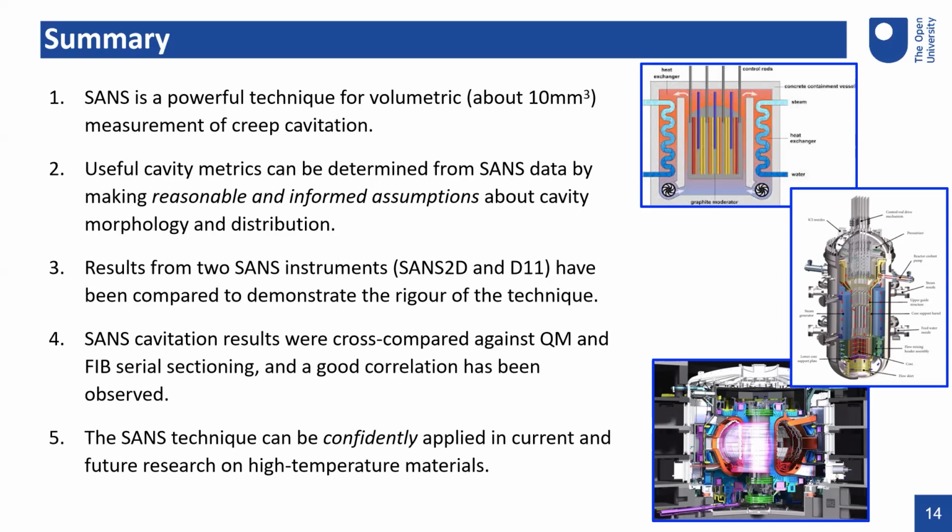So, as a final remark, I think we could confidently use SANS for research investigation in high temperature materials, not just for the current material, but for future materials as well.